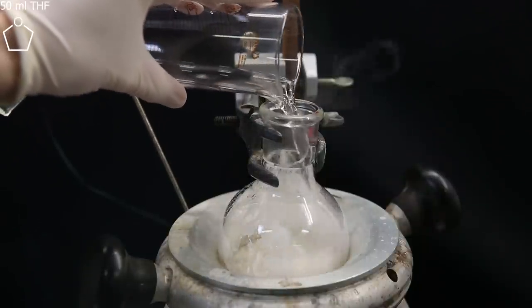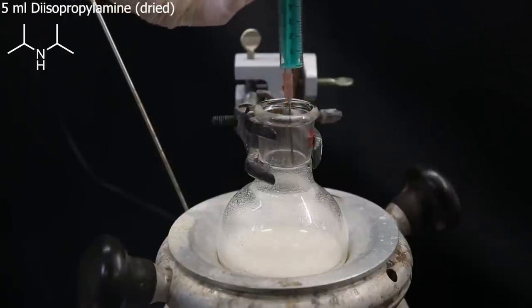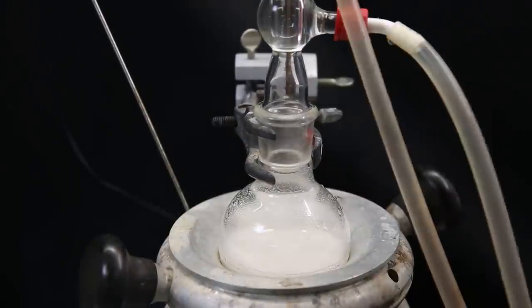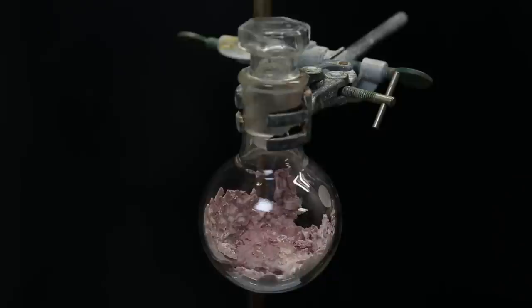So I add in 50 ml of THF as the solvent, and then add in 5 ml of diisopropylamine. The cyclohexyltrimethoxysilane is still present in the mixture, as it didn't distill over, so I don't have to re-add that. I reflux the mixture again for a day, and when that is done, I remove all of the solvent again. Now I am left with a white solid that has some pink impurity. At this point, I left it in the fridge for a few days to work on later, and when I came back to use it, it had turned even more pink.